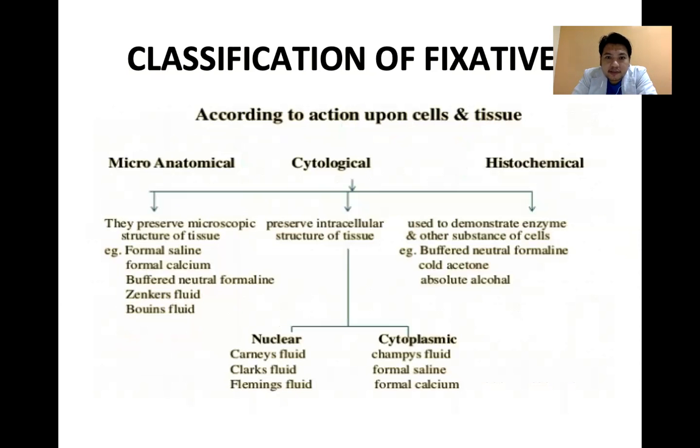Again, classification according to action upon cells: microanatomical, cytological, and histochemical. For cytological, can be nuclear or cytoplasmic. Okay, so microanatomical fixatives preserve microscopic structures of tissues. Cytological preserves intracellularly, and histochemical is used to demonstrate enzymes and other substances of the cells.